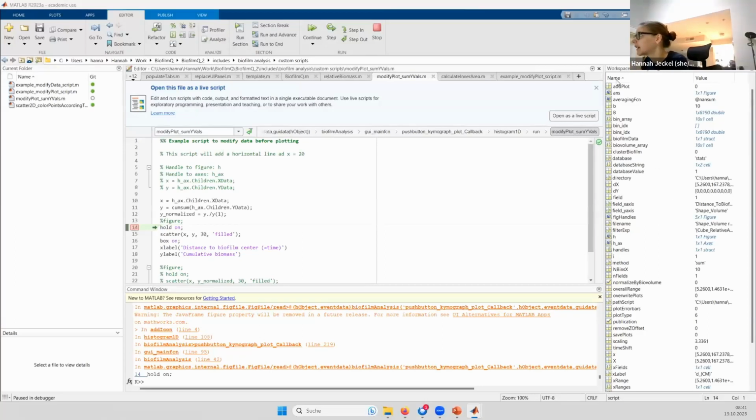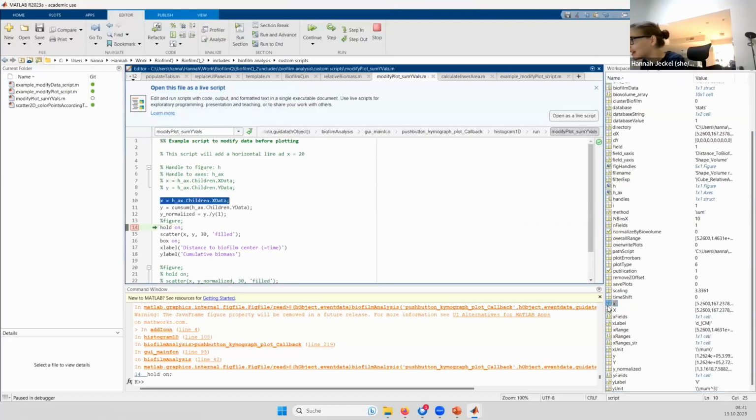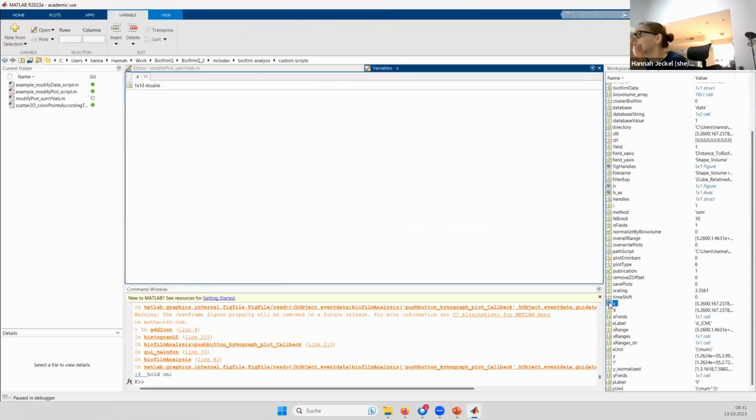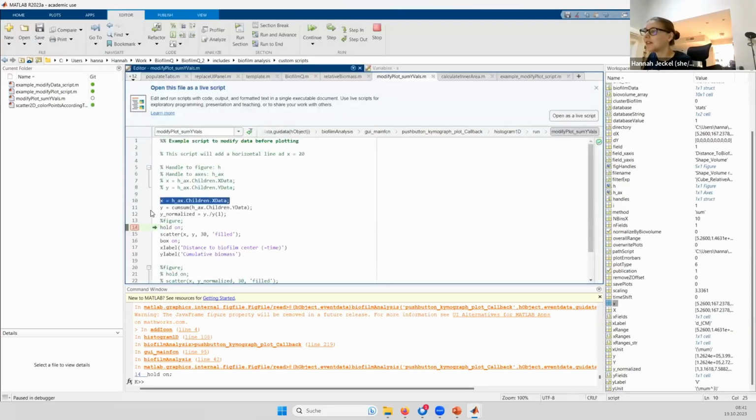I can in fact look at, and this is my workspace in MATLAB. Don't be intimidated by that. It's your friend. It's an amazing feature that we have workspaces when we program. I can look at this X. So X is something that I introduced here, and if I double click on it, I can see the values that are in here. So this is great. This is why debugging is amazing. So right now, it has stopped in this line.